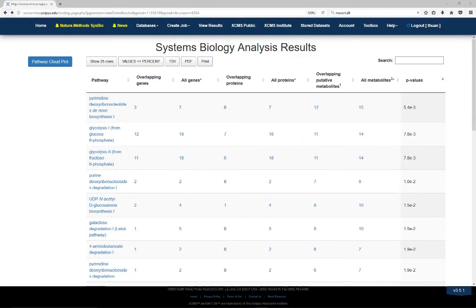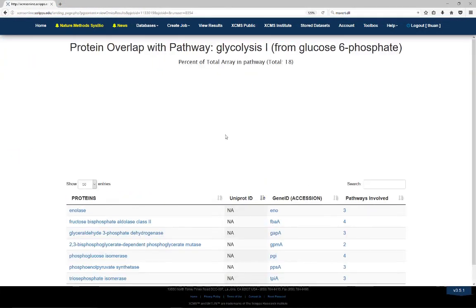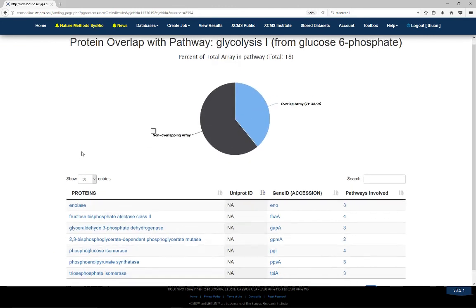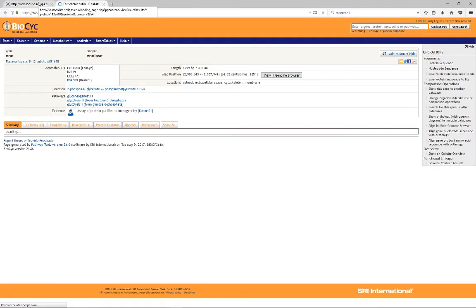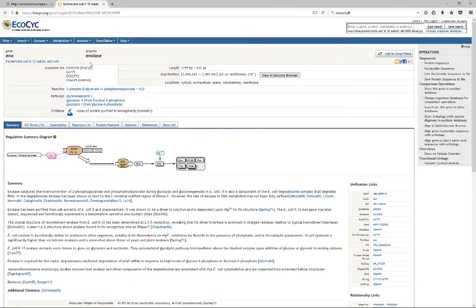In a similar fashion to gene overlap, clicking the overlapping protein number shows the percentage of overlapping proteins in a pathway and a detailed list of the overlapped proteins. Clicking on the proteins in the list links to the Biocyc page that shows related protein information.